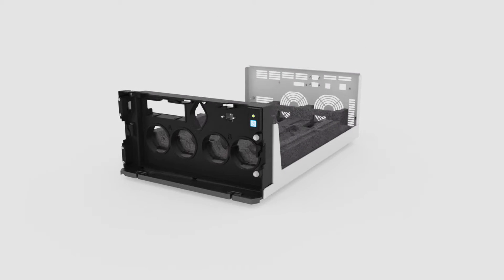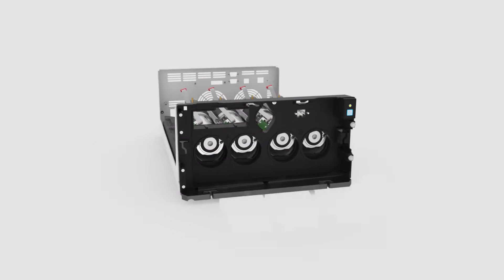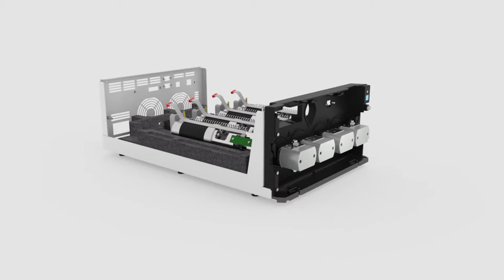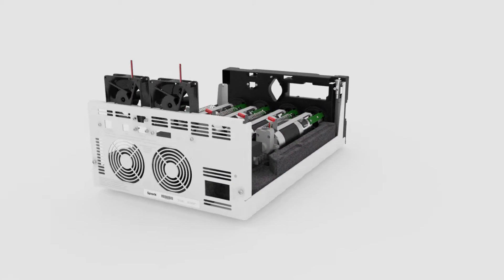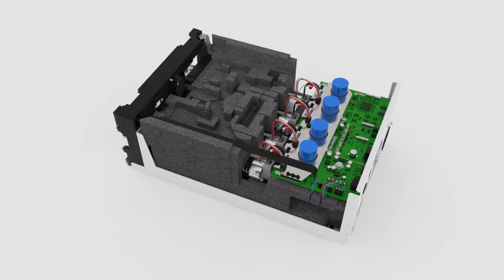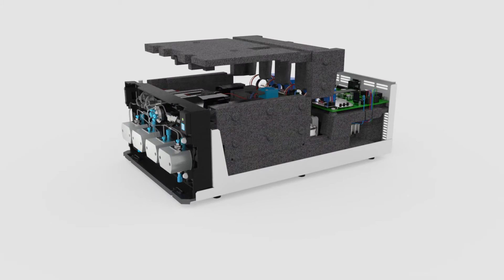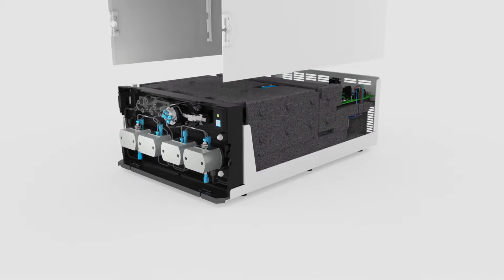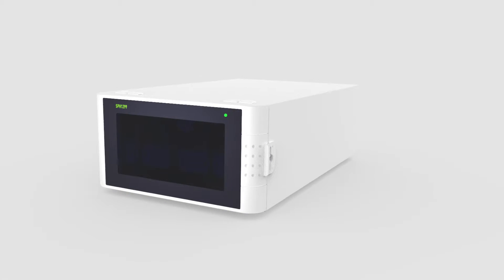Smart design and a proven concept of dual serial pump heads with four individual linear drives has created a robust, state-of-the-art pump with best-in-class performance for ultra-high-pressure liquid chromatography. Individual drives for all pump heads enable optimal regulation of flow and compressibility compensation, providing stable and precise solvent delivery under varying conditions.